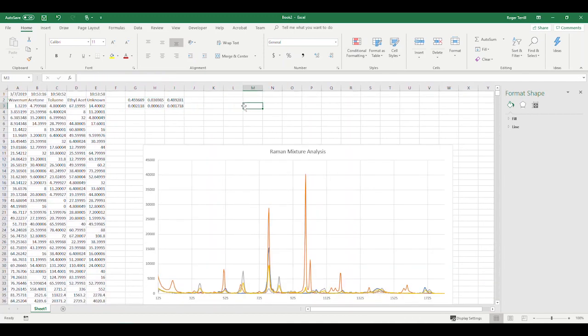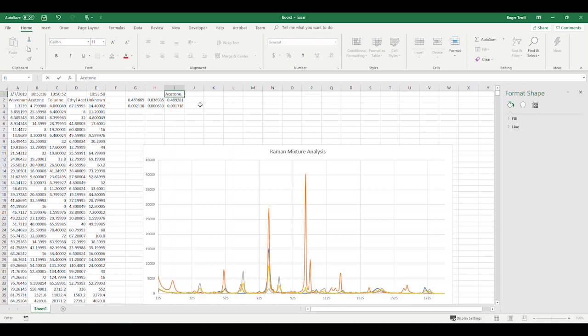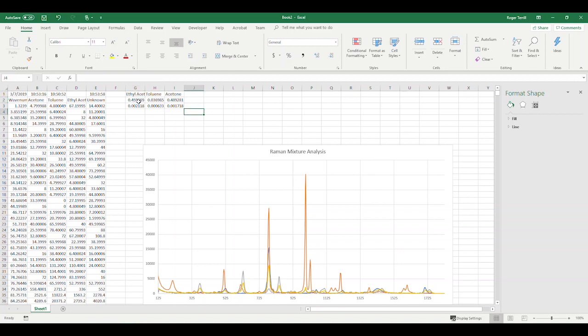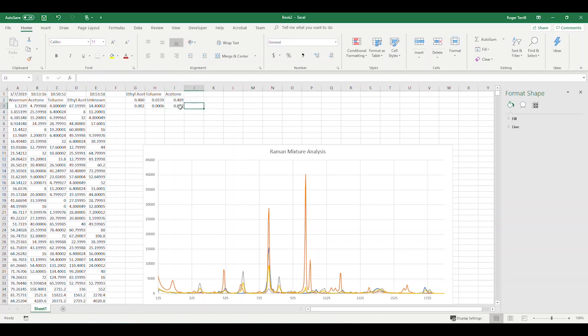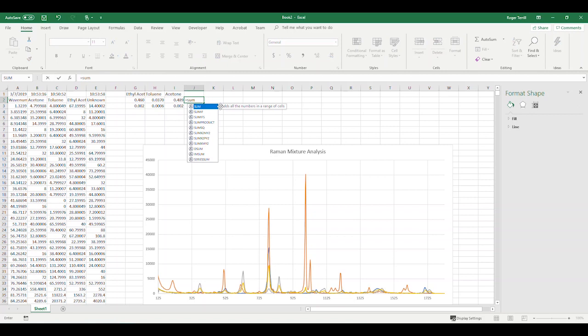Now I'll slide on back up there. And there's our coefficients, and let me put their names on them. This is acetone, toluene, and ethyl acetate. And these coefficients are pretty good there. So if we look at this guy, I'll trim the sig figs until we get down to, say, one sig fig in the uncertainty there. That's 2 out of 500. That's very low uncertainty, very low uncertainty, very low uncertainty there.